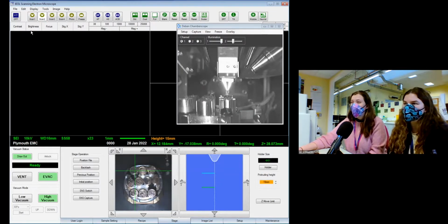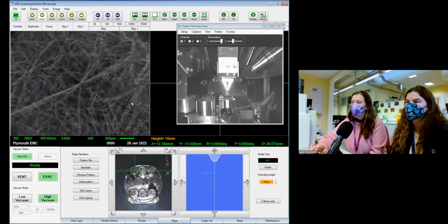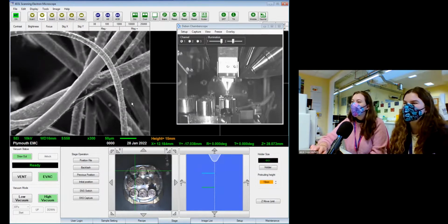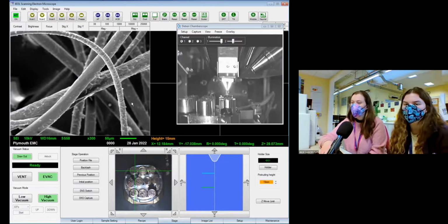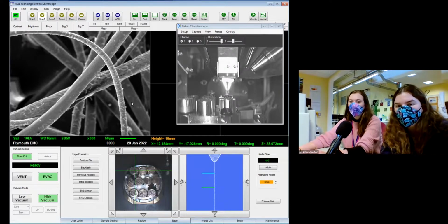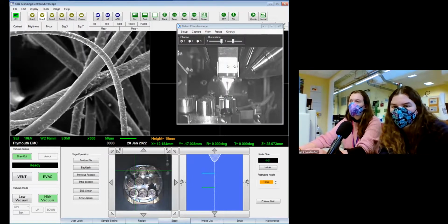So what we're going to do now is turn on the beam. So again, zoom in a little bit. I've already got this one in focus because I planned ahead. If everyone wants to have a guess as to which animal this could be, this is more of a farm animal than a pet. And it should be something that's quite familiar to a lot of people. So if you've got an idea of what this one could be, let me know. And if not, I will spoil the surprise. It's not a huge surprise, actually.